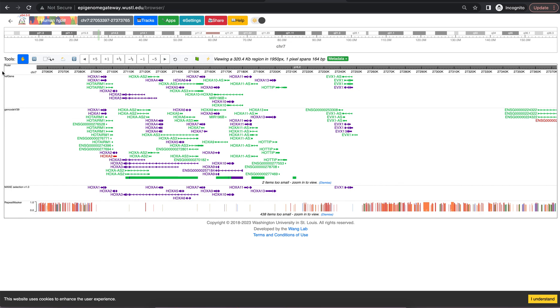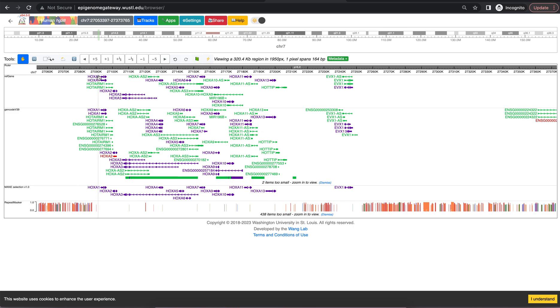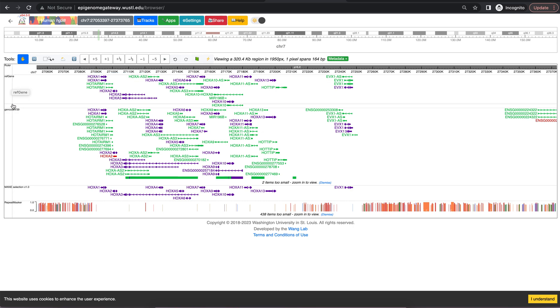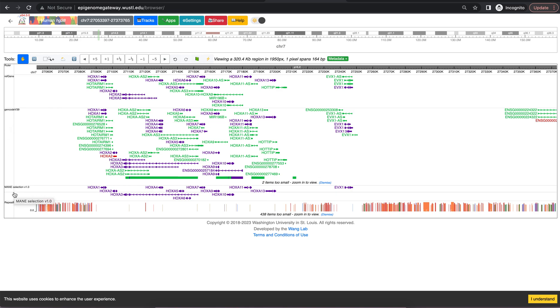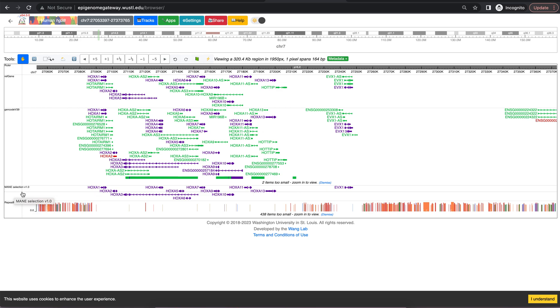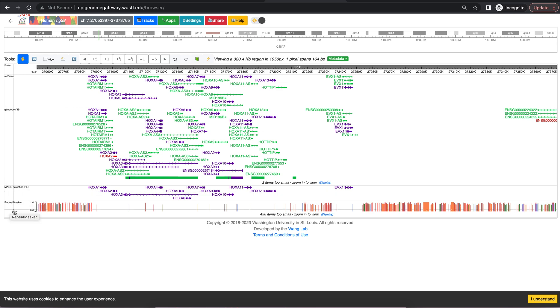Looking at the browser we have the ruler first which shows you the chromosome position and then different positions on that chromosome. Then we have gene annotations from RefGene, GenCode, and the MANE selection which is an NCBI and Ensembl collaboration. Below that is the repeat masker which is a catalog of repeat elements in the genome.